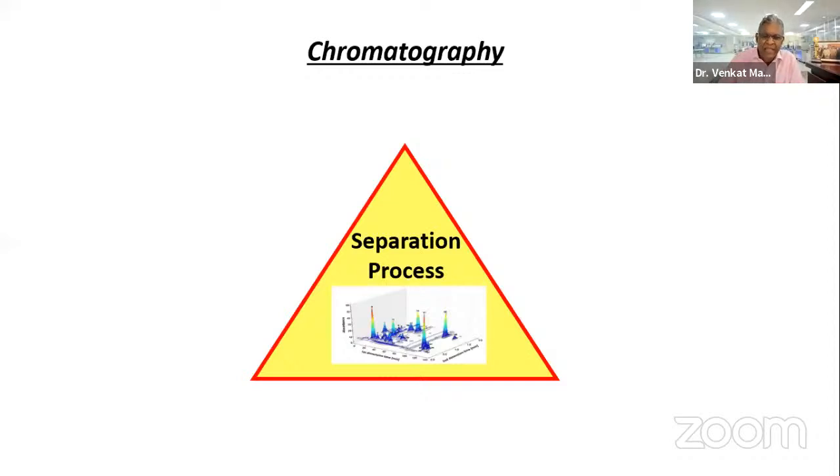basically it is nothing but a triangular reaction. What do I mean by a triangular reaction? Very, very simple. I have an analyte, my compound of interest. This compound of interest, I dissolve in a solvent, in a liquid medium. Mostly, I preferably use the mobile phase. Then I make that solution ready. When the solution is ready, the solution comes and interacts with the column. That's all.